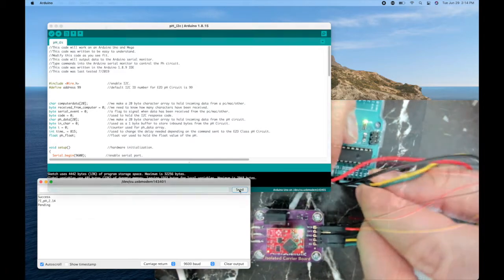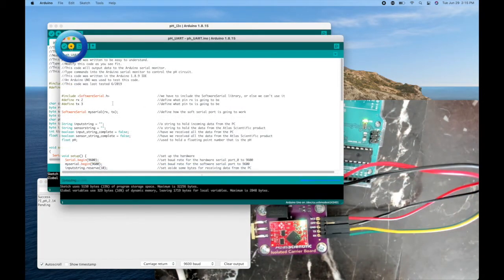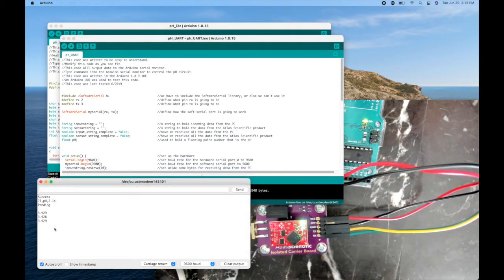To make sure that worked, I'll go back to the UART code, upload it, and now we're getting our readings again. And that's how to swap between the two modes.